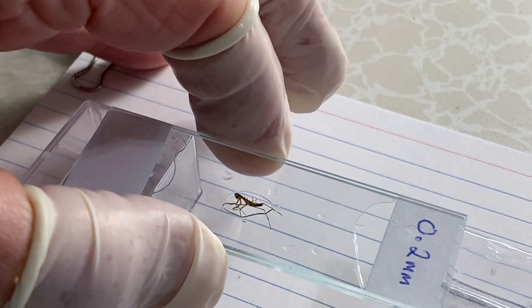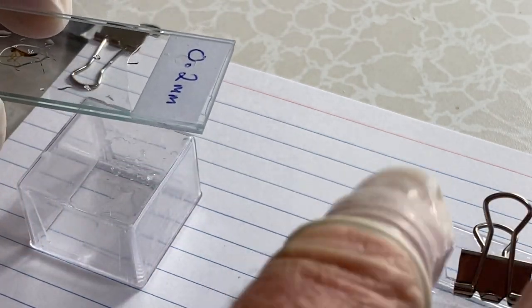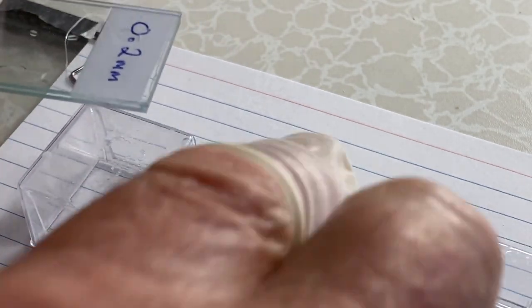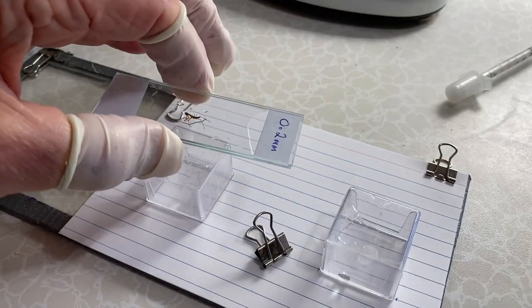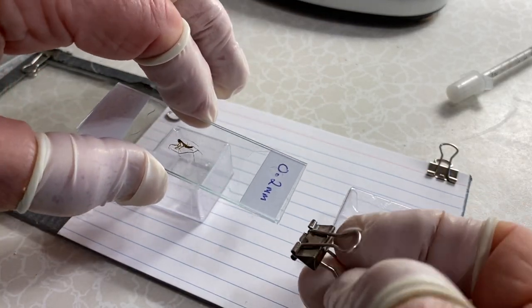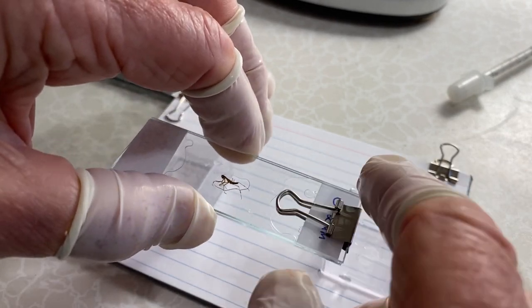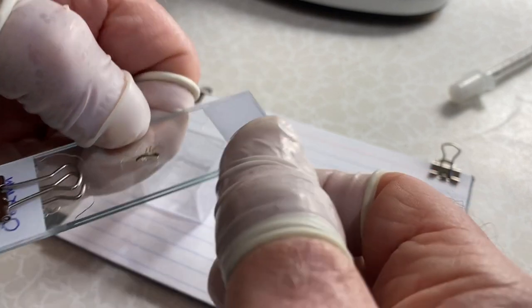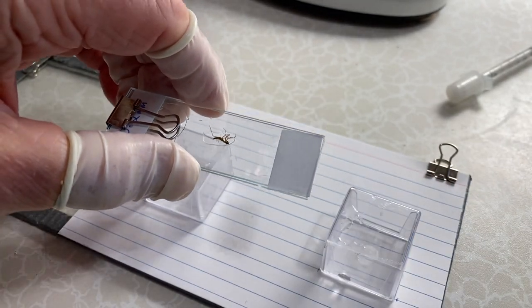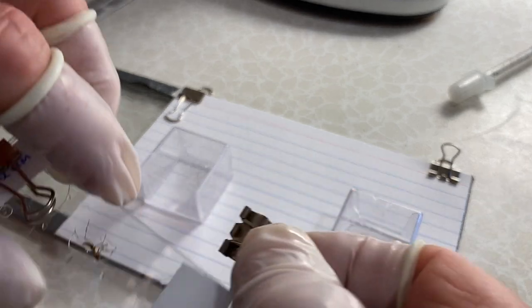Once we have the insect between the two pieces of glass, I have these really small clips. Place one on one end like that and one on the other end — that will hold it in place during the dehydration process.